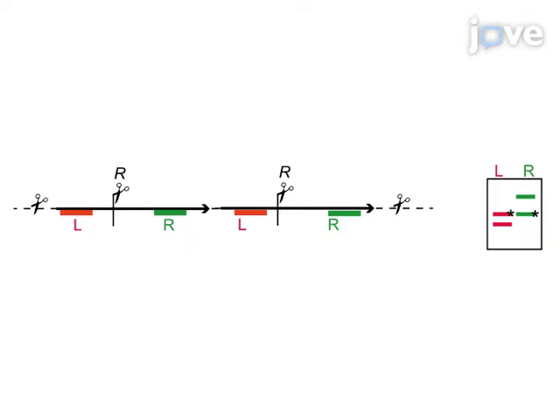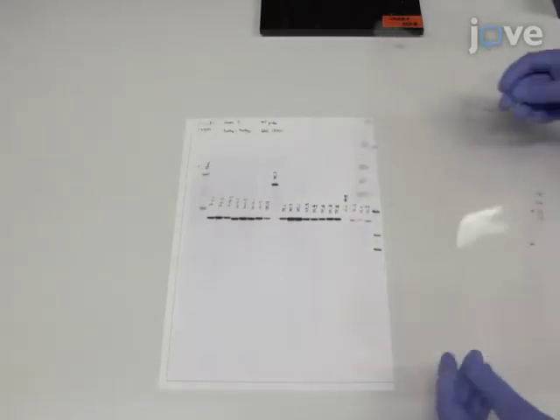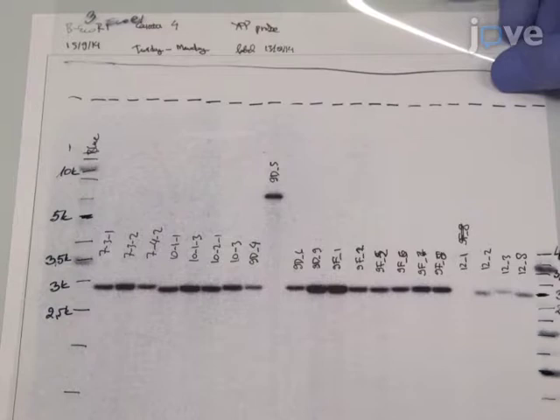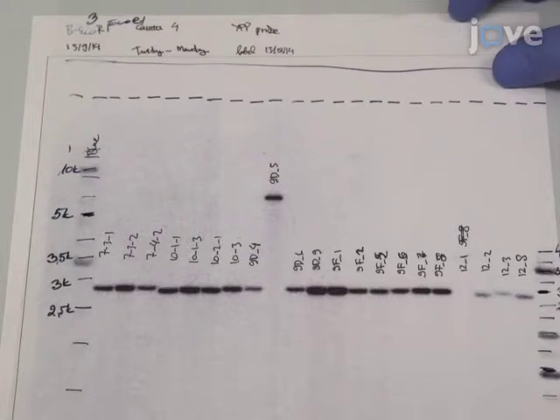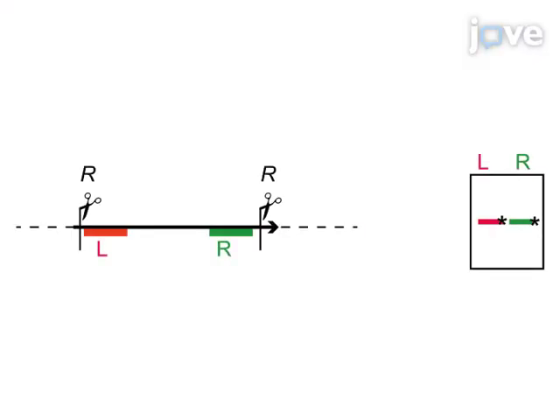the restriction strategy. To examine if the transgenic sequence of interest is intact, analyze the blot prepared according to the strategy with restriction sites at the extremities of the sequence of interest. Estimate the size of the hybridizing fragments on the blot based on the size of the marker bands, and compare it with the expected size. An intact insertion yields a single fragment with a defined length. Any deviation from the expected length indicates incomplete integration.